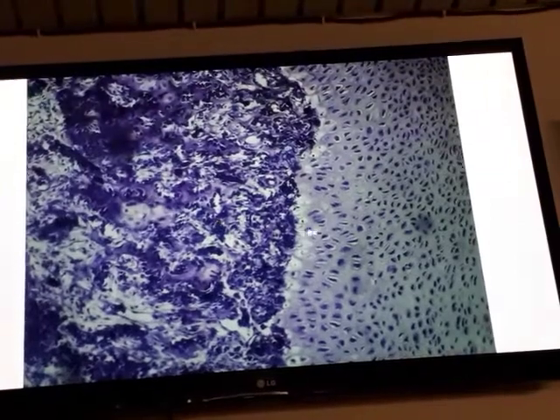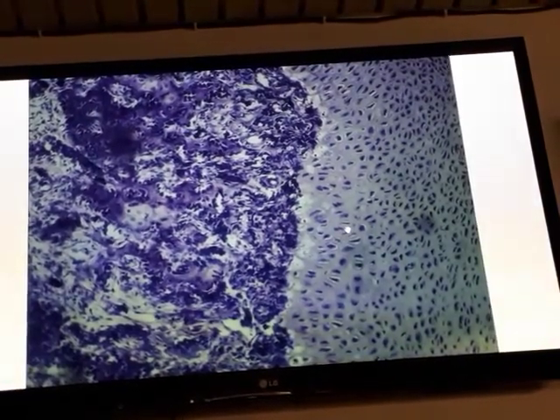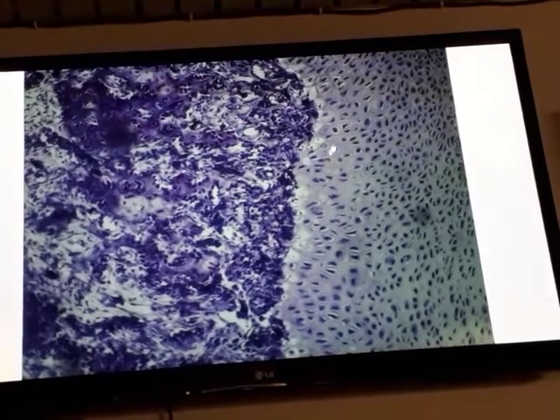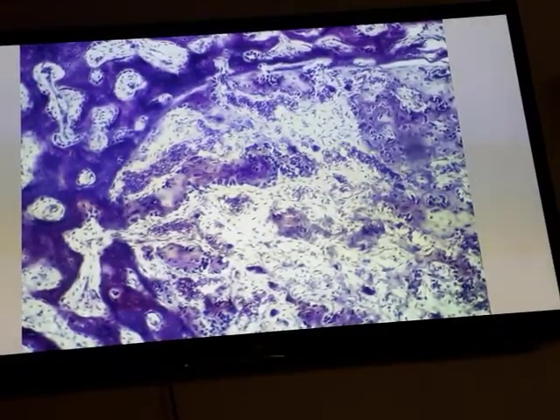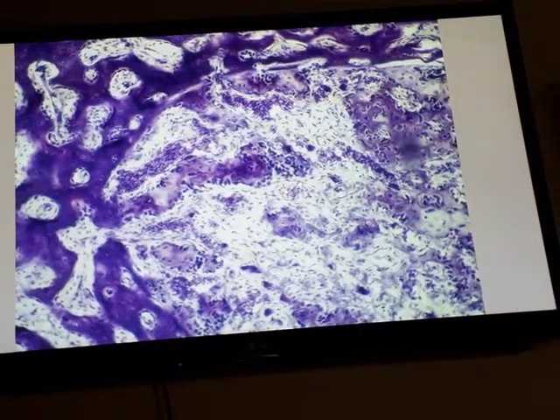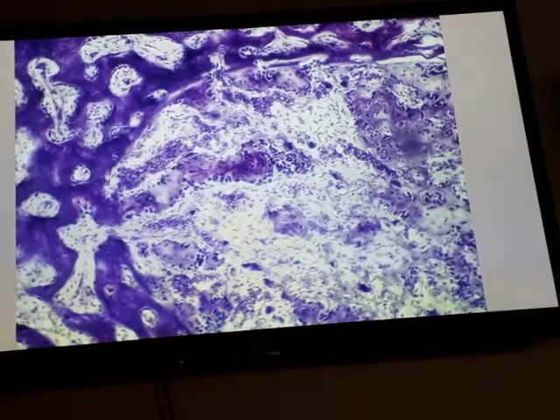The third zone is the hypertrophic zone. The chondrocytes are very large and the cytoplasm is full of glycogen. The fourth zone is the calcification zone, where the thin septum of the matrix becomes calcified and the chondrocytes die. The last zone is the ossification zone, where endochondral bone tissue appears with osteoprogenitor cells, osteoblasts, and other cells.